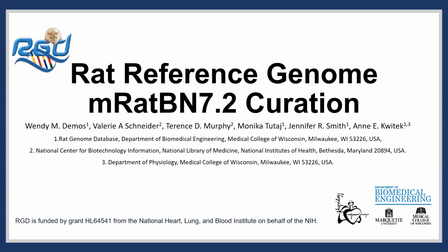RGD joined the Genome Reference Consortium, GRC, to further improvements of the mammalian rat Brown Norway version 7.2 genome assembly through the curation of errors brought forward by RefSeq curators in the rat community. Today, I'm going to describe the workflow used to resolve those reported issues.